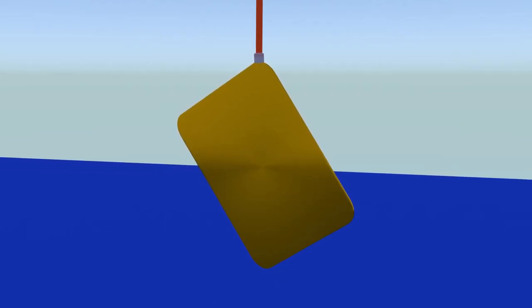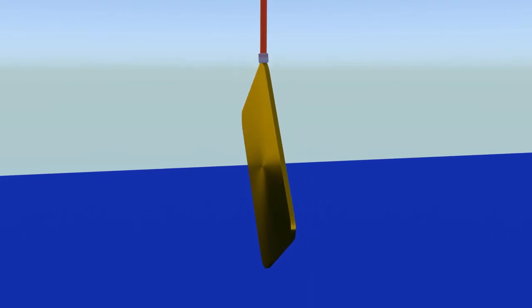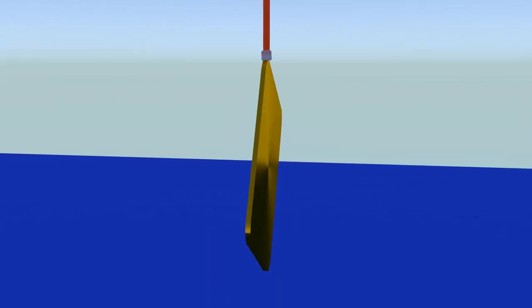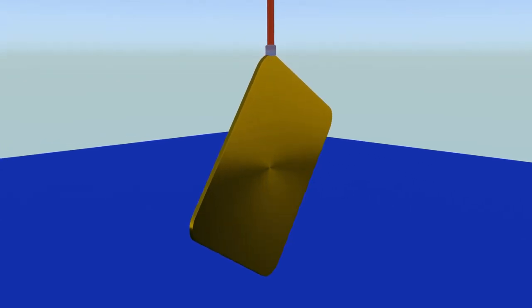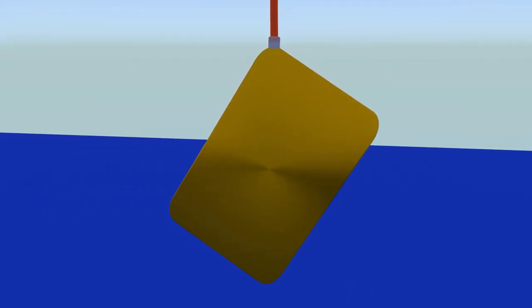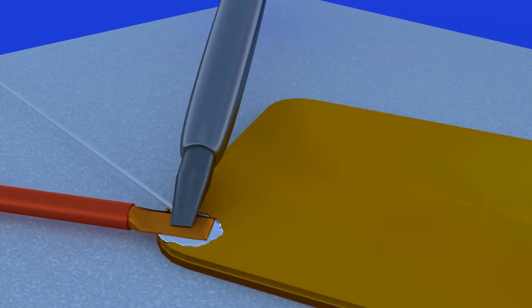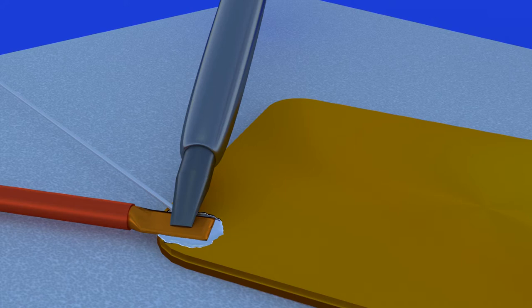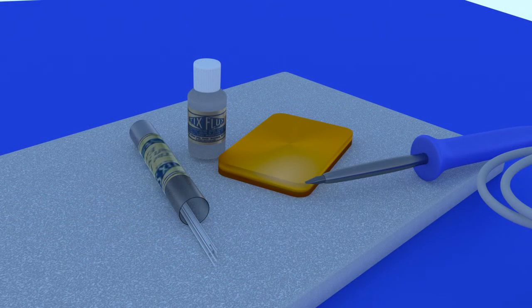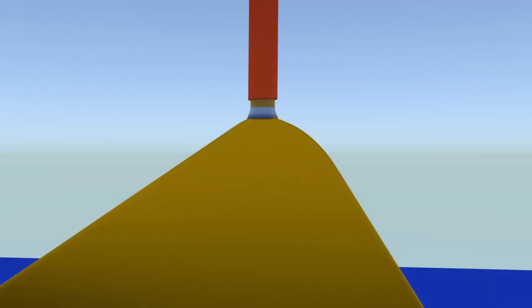With the salt system, you can also refine ingots, either individually or at the same time as refining rings. As with rings, refining ingots requires electrical contact. Use 8 gauge or thicker coated copper wire. You can solder the wire either using a torch and silver solder, or you can solder the wire using a soldering iron and dick solder. Lead or lead-tin solder cannot be used because it will not stick. Cover the exposed portion of the wire with either silicone sealant or heat shrink tubing.